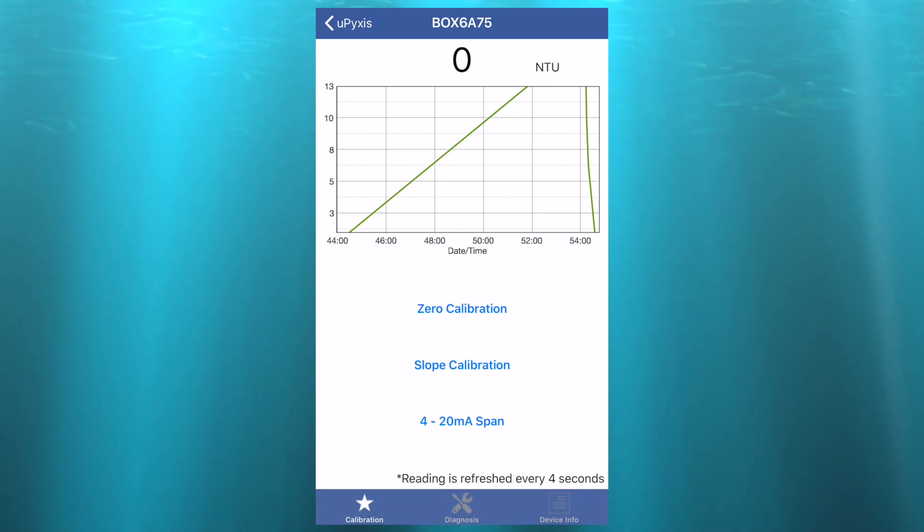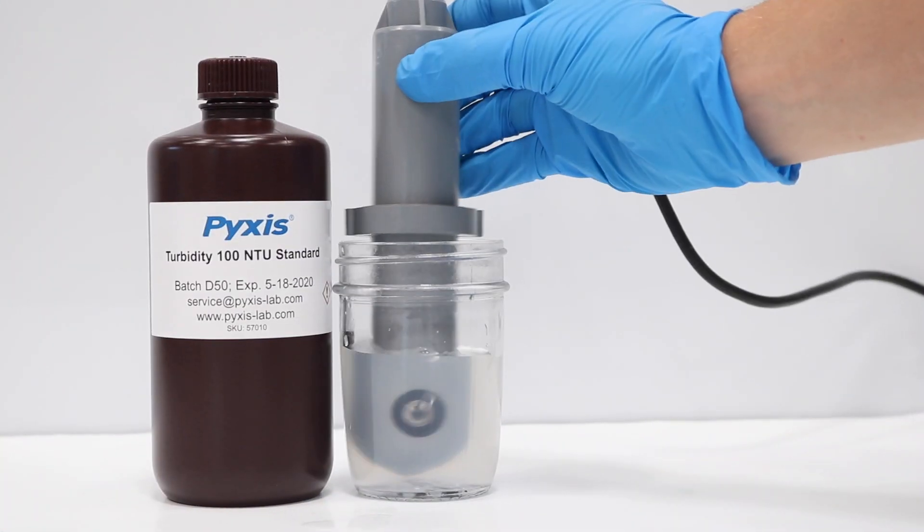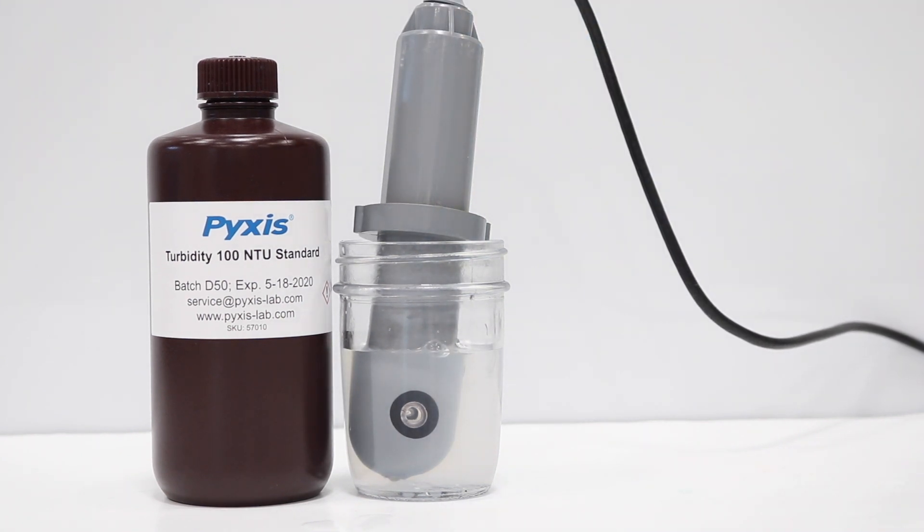A calibration success message will appear, and the reading chart should begin to display zero. Next, place the ST730 into Pixis Turbidity 100 NTU Standard.